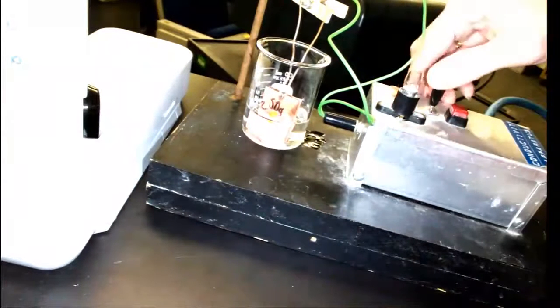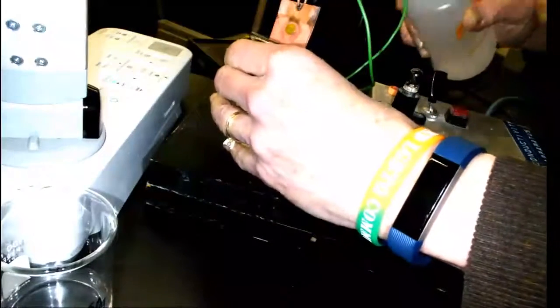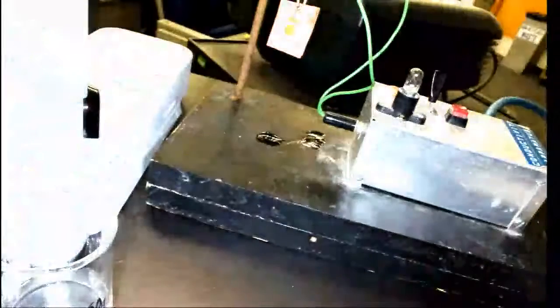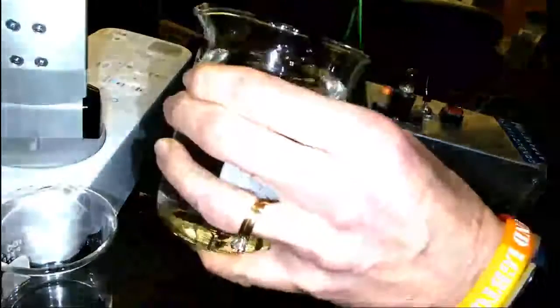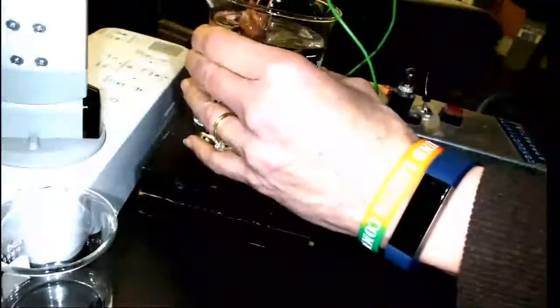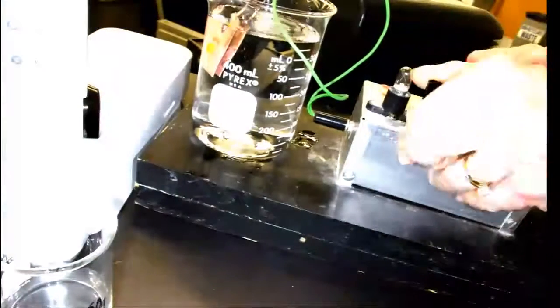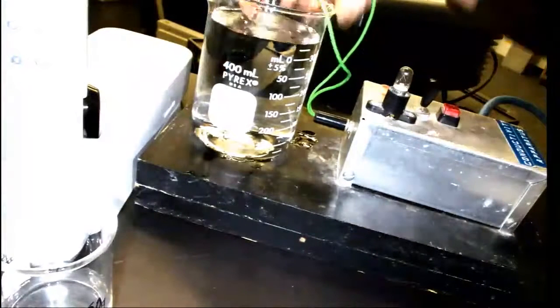We flip the switch, remove the electrodes from the solution, and test the other solution that I'm going to compare this time. First I have to rinse the electrodes so you don't have any contamination from one solution to the next. I rinse them into a little bit of water in the beaker, and then I will totally immerse the electrodes in a bigger beaker of water to make sure it's completely clean and to verify that there are no ions left in the solution or on contact with the electrodes. No glowing light bulb, the electrodes are clean. Pull up the electrodes again, remove the beaker.